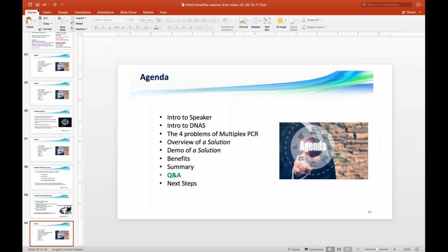In other words, let's say you already have the design for your control, then you can input that into the software and it will design all the other members of the multiplex in the presence of that control. What was the other question? That was the only one. Okay, I didn't ask the other 2.